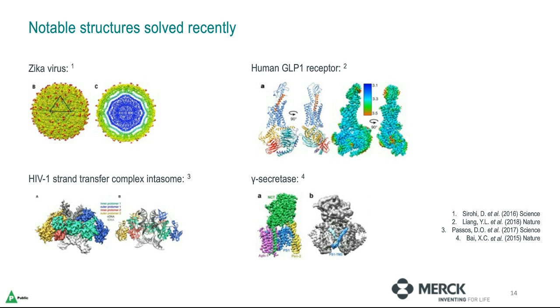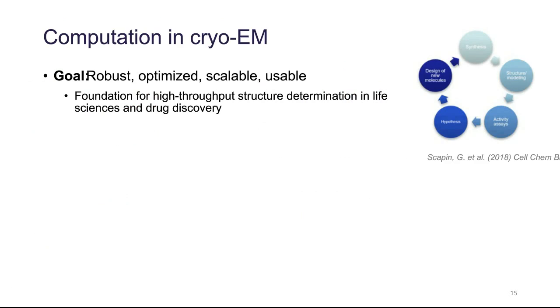Thanks, Jakob. Jakob has now given us a clear idea of how CryoEM fits into drug discovery. In order for drug discovery processes to use CryoEM in the inner loop for target identification, hit identification, and especially lead optimization, all parts of the CryoEM workflow need to be made as robust as possible. This is what will allow large pharma drug teams, smaller biotechs, and academic labs working on disease indications to treat CryoEM as a powerful but black box technique that can shed light wherever needed in a drug project.